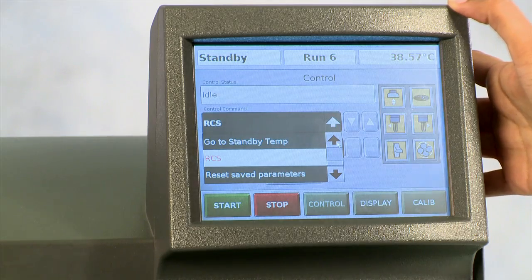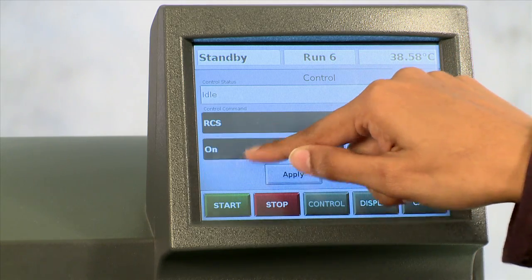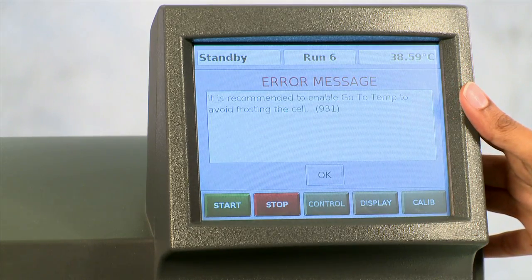Moving on to the DSC touch screen, you can turn on the RCS by selecting from the pull-down menu RCS on and then apply. You can hear the RCS compressor begin to come on. There is a message here that says it is recommended to enable go to temperature to avoid frosting of the cell.